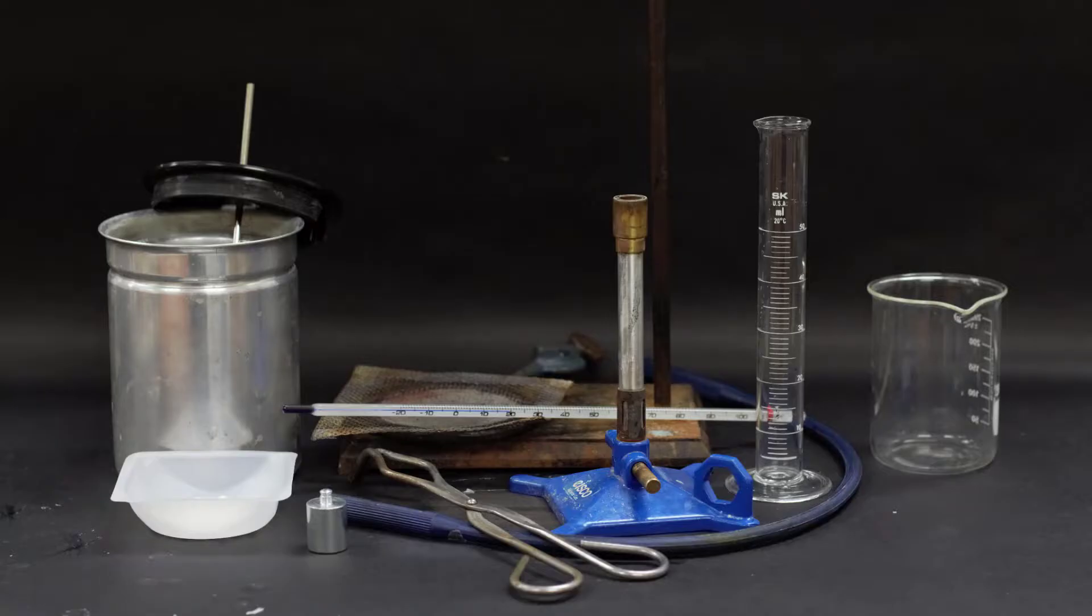The materials we'll need here are the calorimeter, a ring stand with a ring and mesh, a Bunsen burner, a 50 milliliter graduated cylinder, a 250 milliliter beaker, tongs, a thermometer, a metal cylinder, and a soluble salt compound.